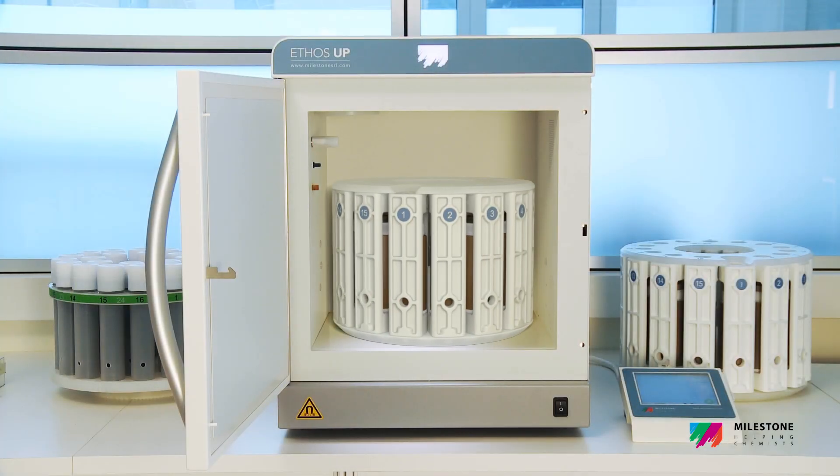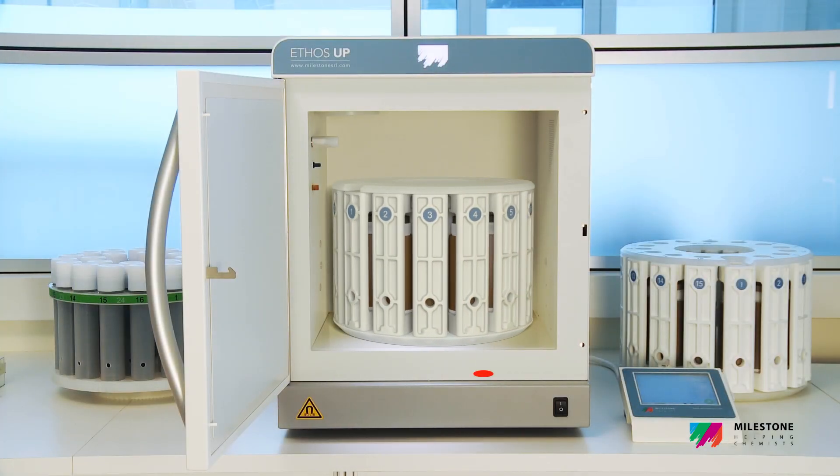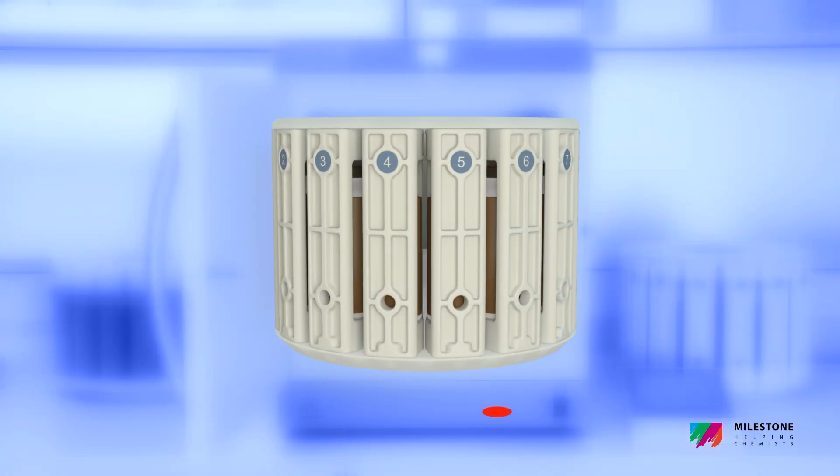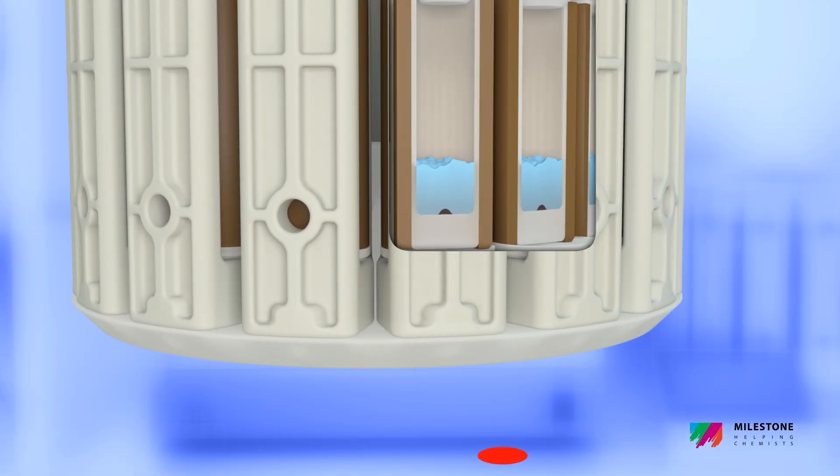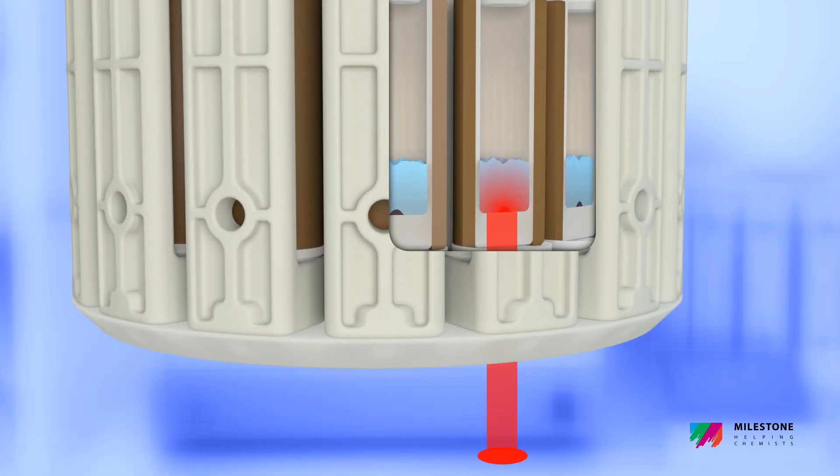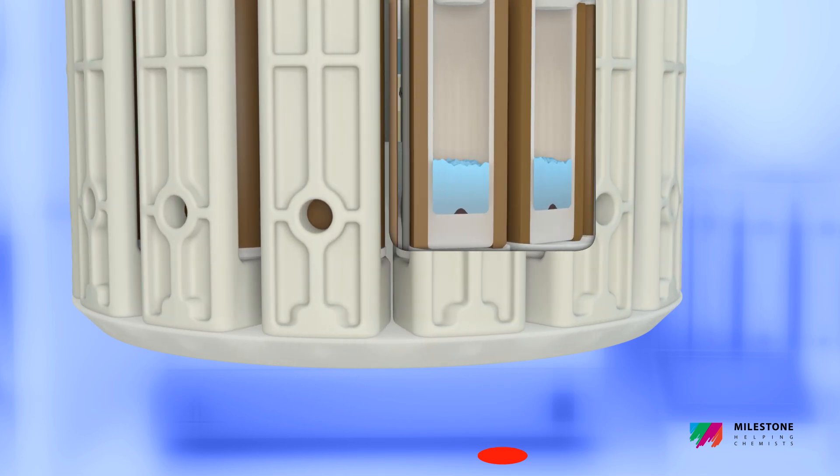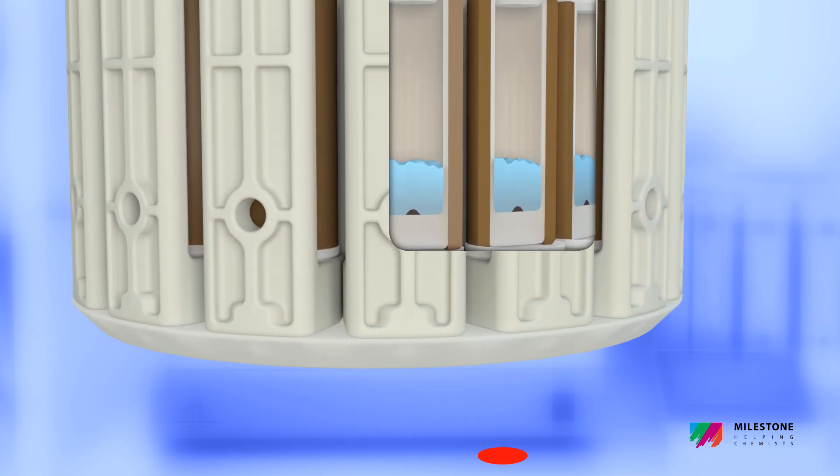Milestone's EZTemp contactless sensor directly controls the temperature of all samples, providing accurate temperature feedback to ensure both the complete digestion in all vessels and a high level of safety, enhancing the overall ease of use.